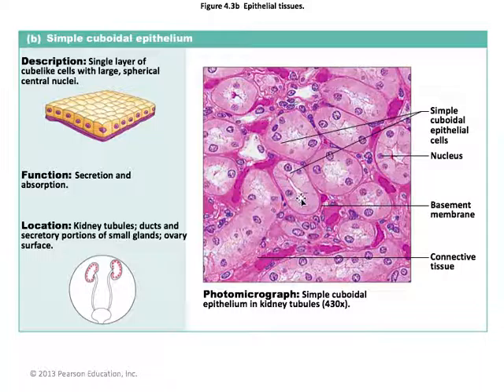Here we have cubes. You know, they don't really look like cubes, do they? The reality is never the same as the ideal, is it? So let's take a look here. What we're looking at are tubes. We're looking at structures that, in this case, this is one that has a cross section. In other words, it's been cut across, it's been cut horizontally. So you can think of this like a straw.